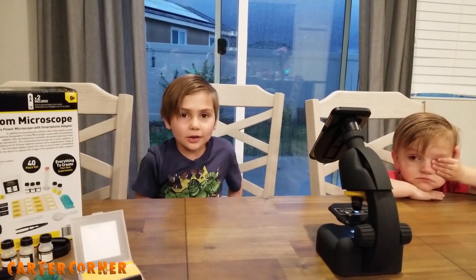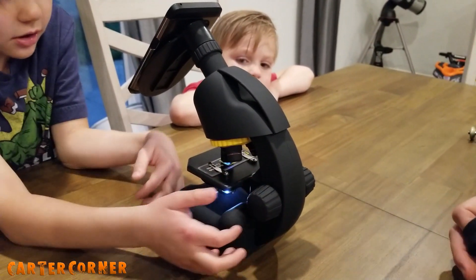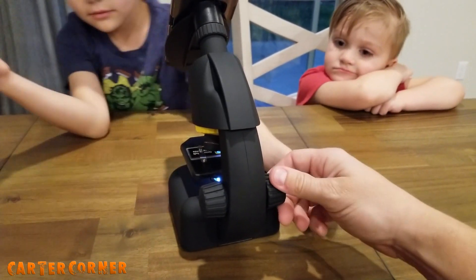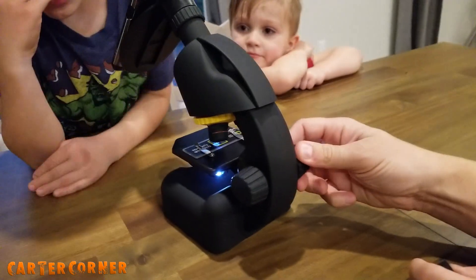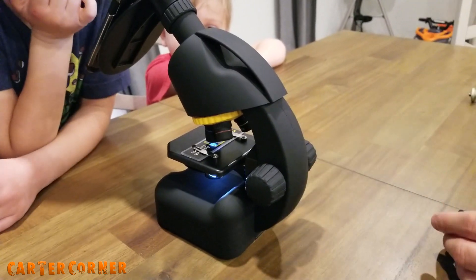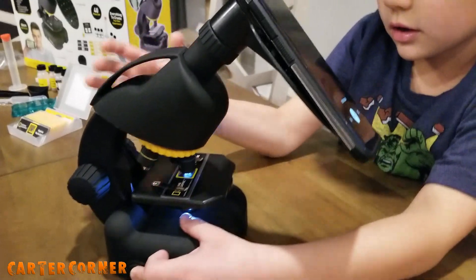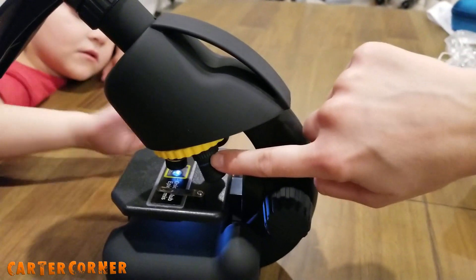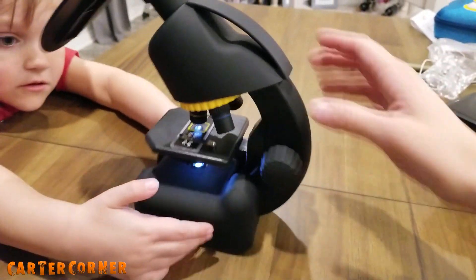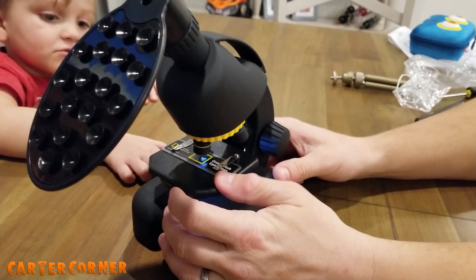Now I'm going to show you the knobs. These are to make it focus — see, when you turn this, it lowers and raises the platform. So by making the distance either shorter or longer, it'll help you get it in focus. This turns the light on and off. These control how much the specimen gets magnified. And then this adjusts the amount of light that goes through.